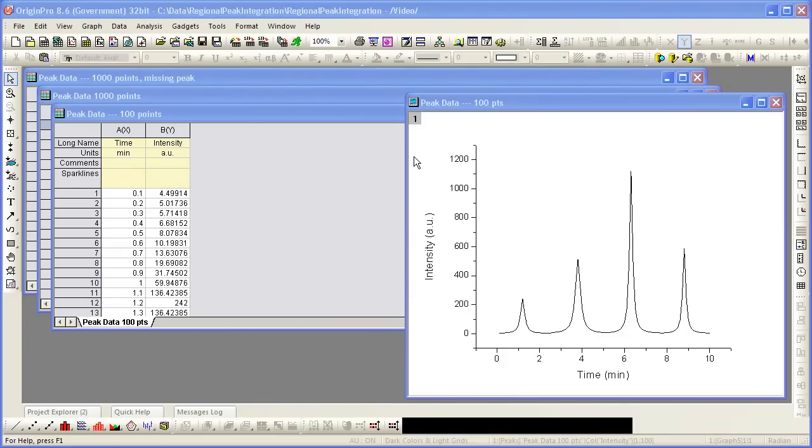To demonstrate, I start with a simple dataset consisting of 100 points that contains 4 peaks. I have it plotted to the right of my screen.